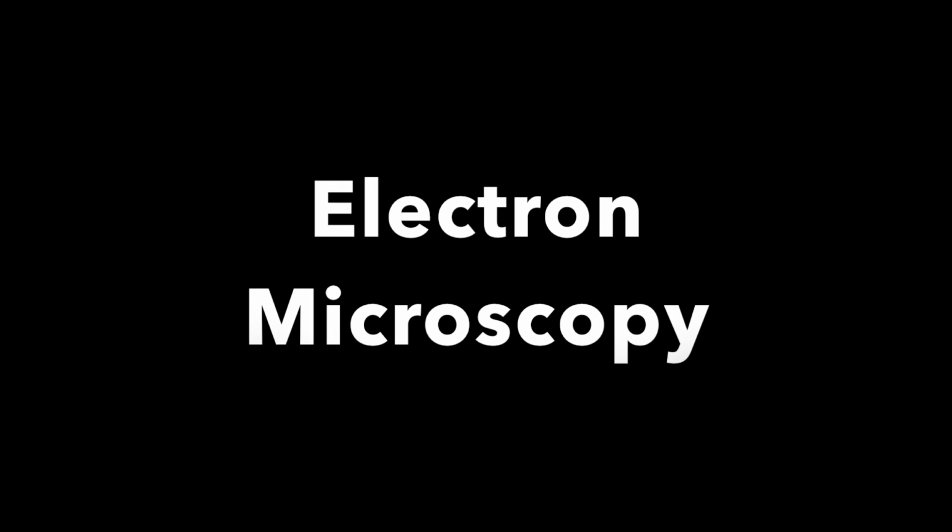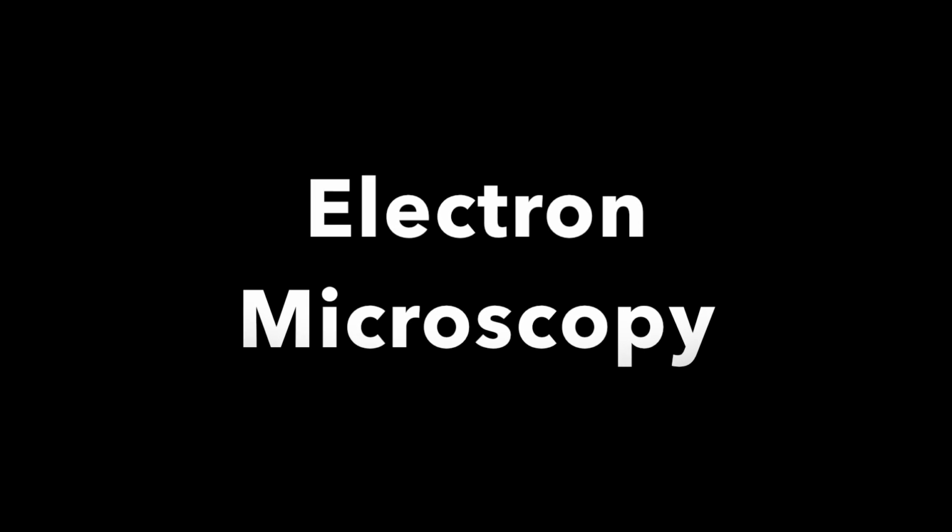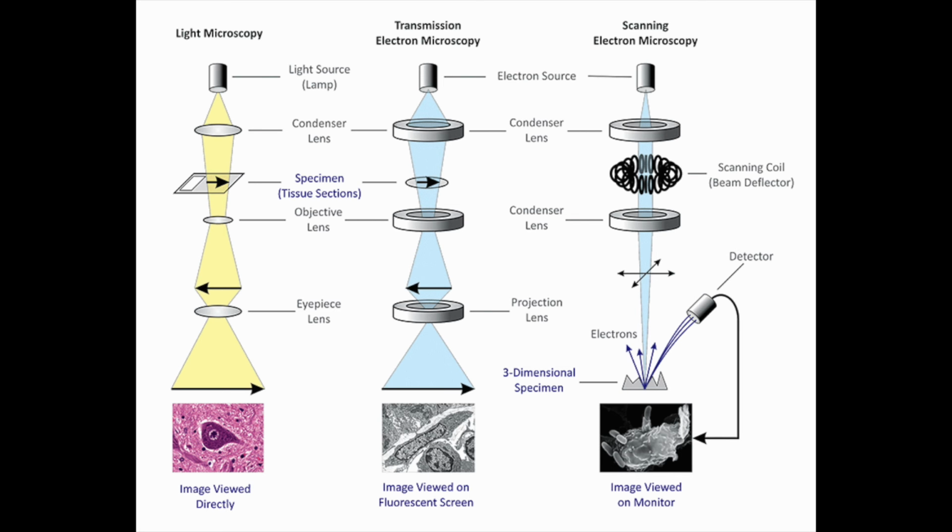Electron microscopy utilizes electrons rather than photons to create an image. The method is capable of much higher magnifications and has a greater resolving power than a light microscope, allowing researchers to see much smaller objects in finer detail.